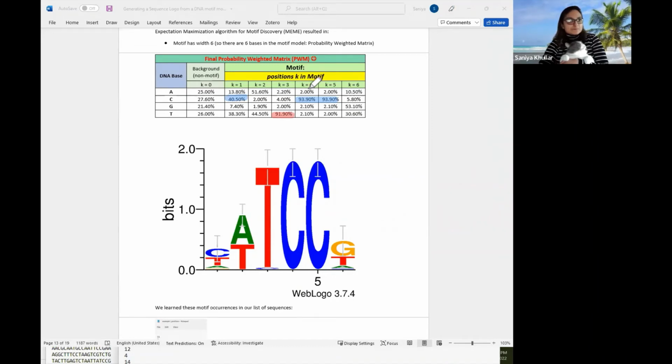I think that's about it. And then for G, it wasn't so strong, but G was here, for instance. And then A just had a small relative advantage here.